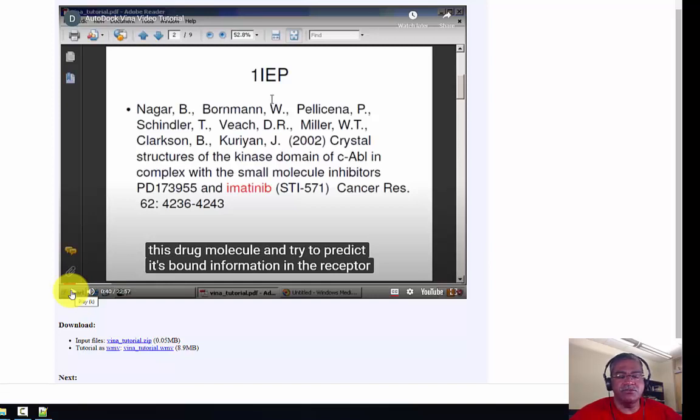And then you say, do I need to do some targeted mutations to see if those interactions change, how the receptor responds structurally to this kind of docking? This is one of the reasons why the impetus for drug design software to do hundreds and thousands of these kinds of interactions, and for developing the software, is quite high.